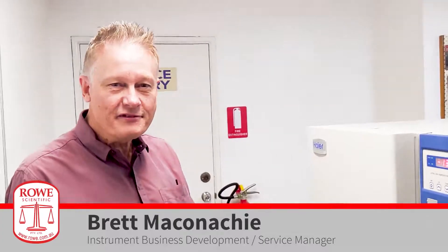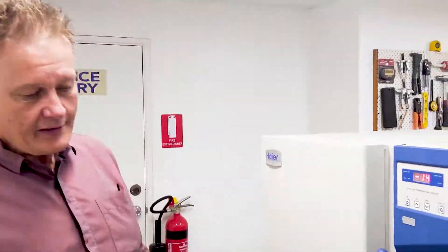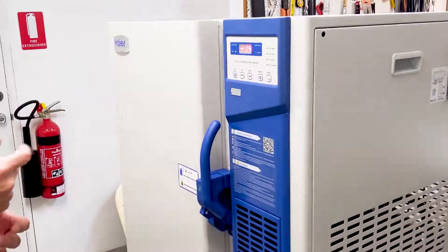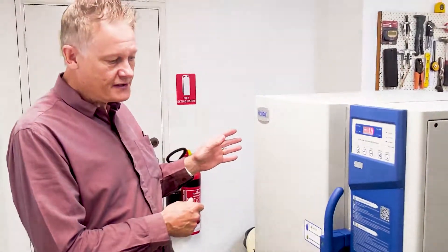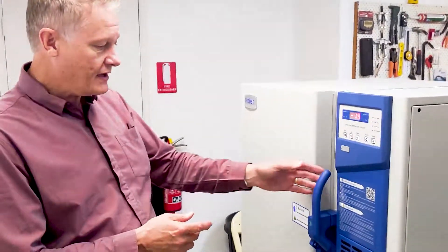Hi everyone, welcome to our quick little overview of the latest Haier ultra low temperature freezer that we've just brought in. We're in the workshop here and we've unboxed it. What we've got here is a 100 litre version of the minus 86 degree temperature freezer. I'll just go through some of the quick features that it has.